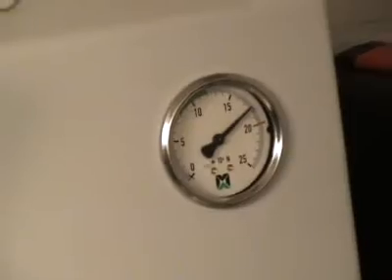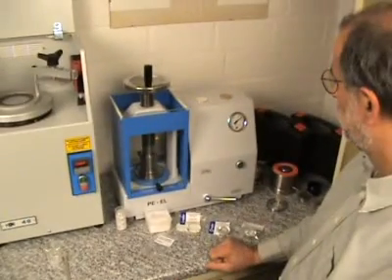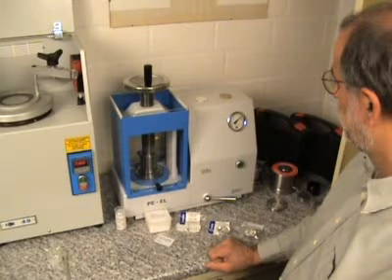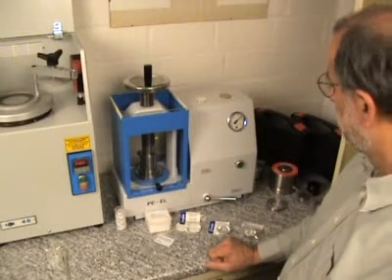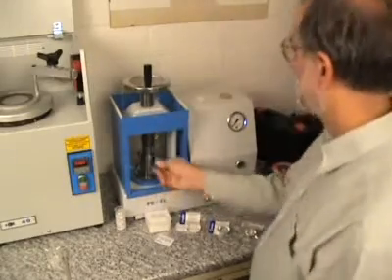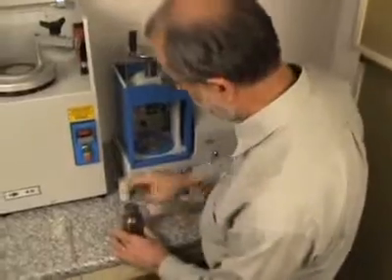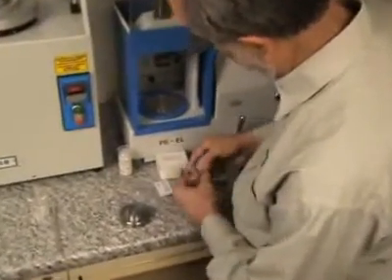You normally keep a holding time of about one minute at the preset press force. Then you release the valve and take out the die set. The die set is disassembled and the pallet in the aluminum cup is pushed out by hand.